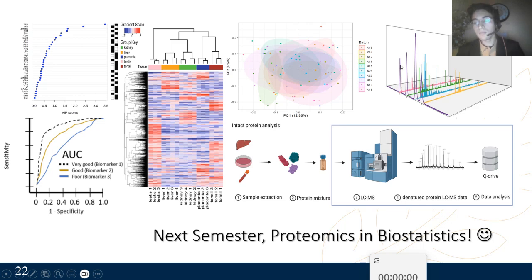You can use it for a lot of things. You can find molecular markers or metabolic markers or whatever in cancer patients or in Alzheimer patients. You can do a lot of statistical analysis on it. You can do an ROC AUC for how well this marker that you picked is good for your detection. You can do a PCA analysis to separate each component based on how well they define your data or define the group that you're studying, like Alzheimer group or cancer group and so on.